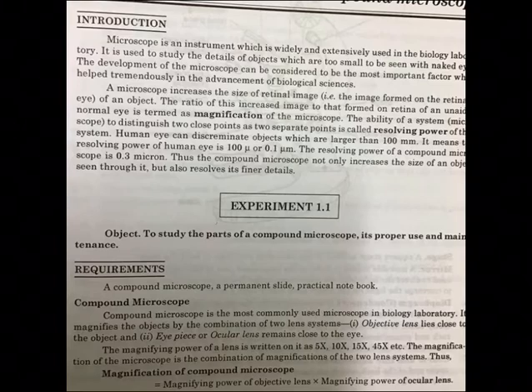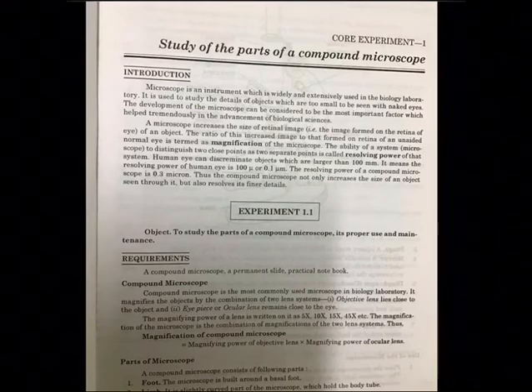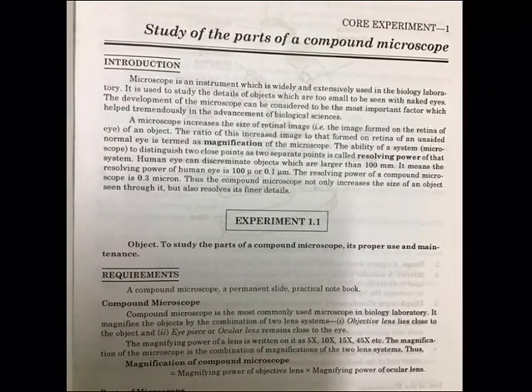Microscope is an instrument which is widely and extensively used in the biology laboratory. It is used to study the details of objects which are too small to be seen with the naked eye.